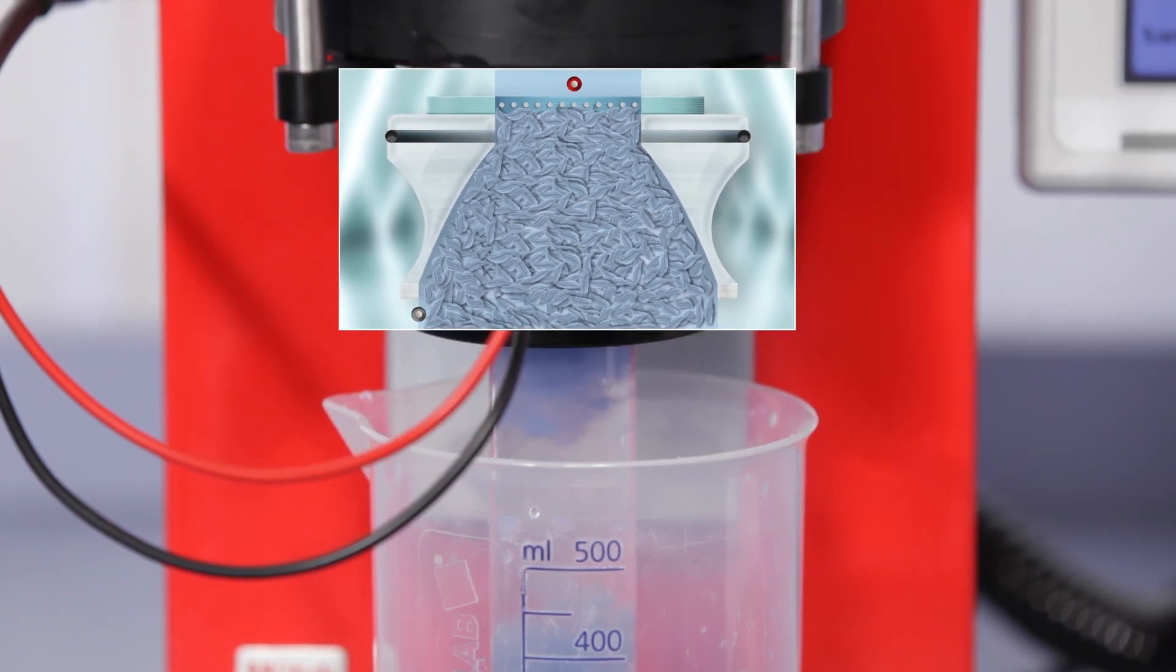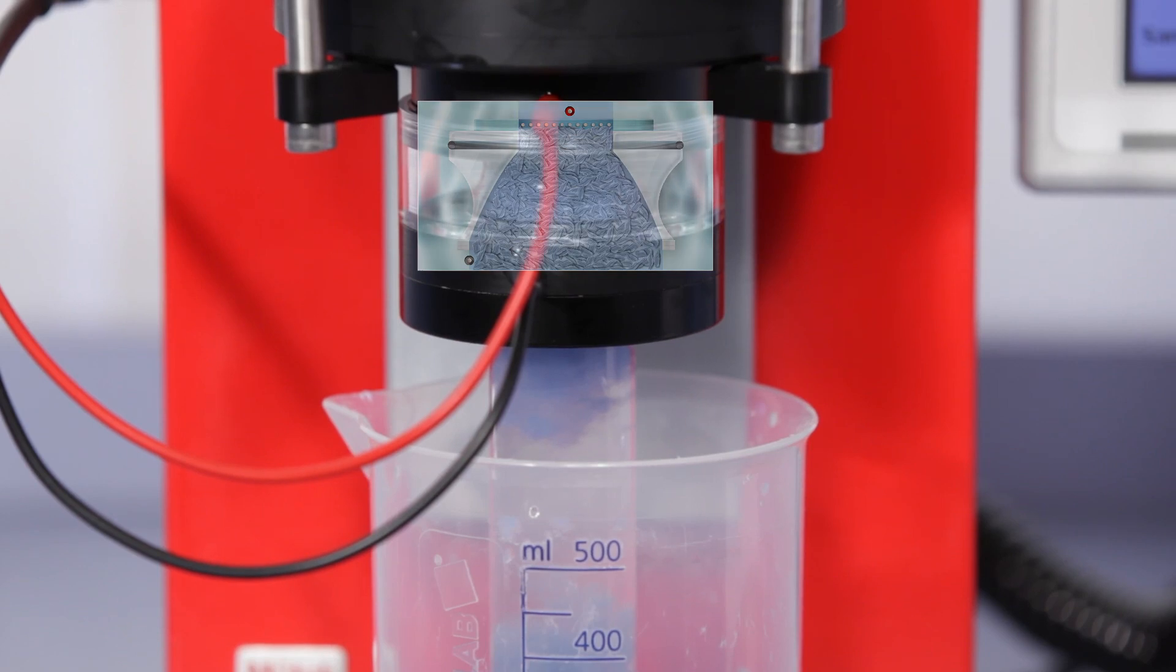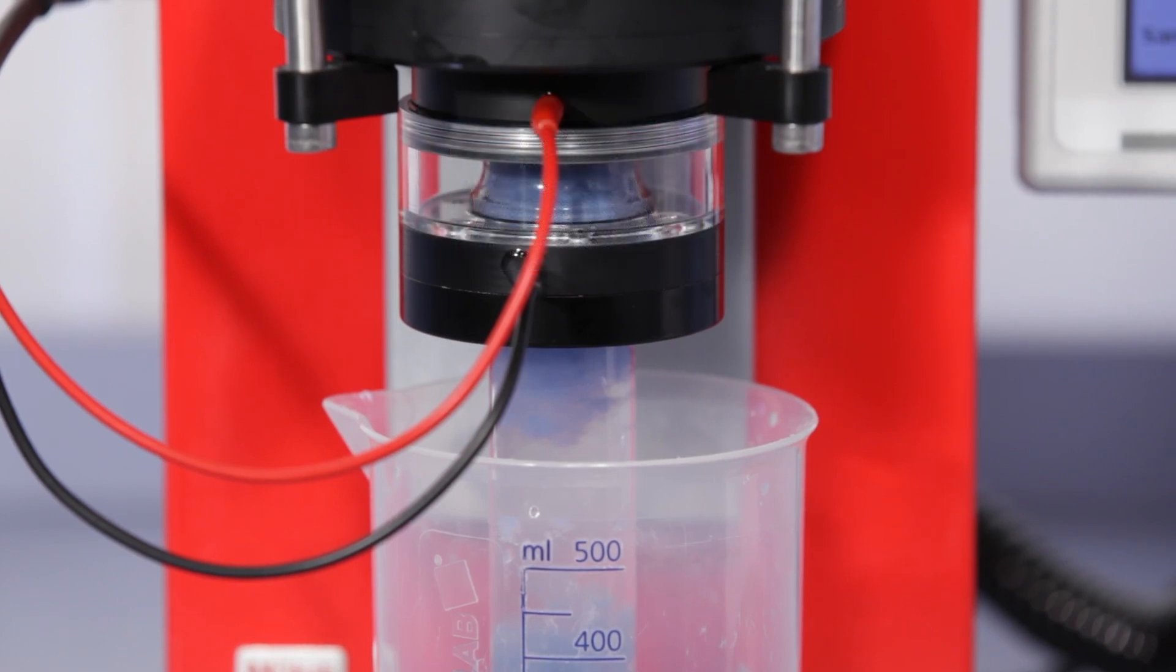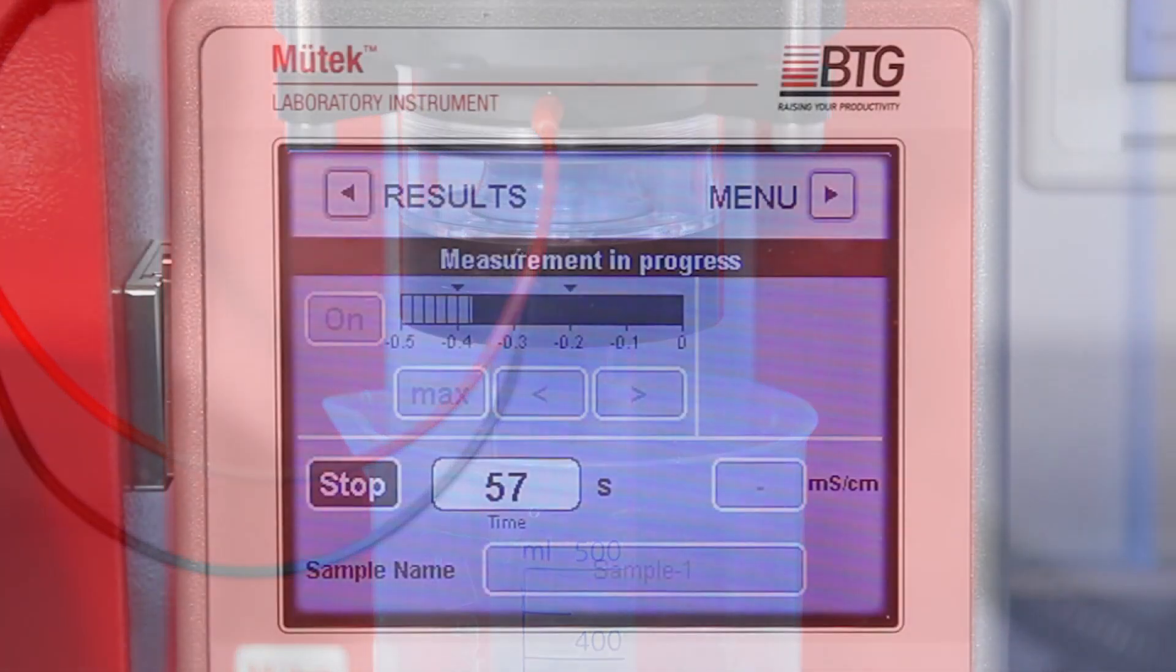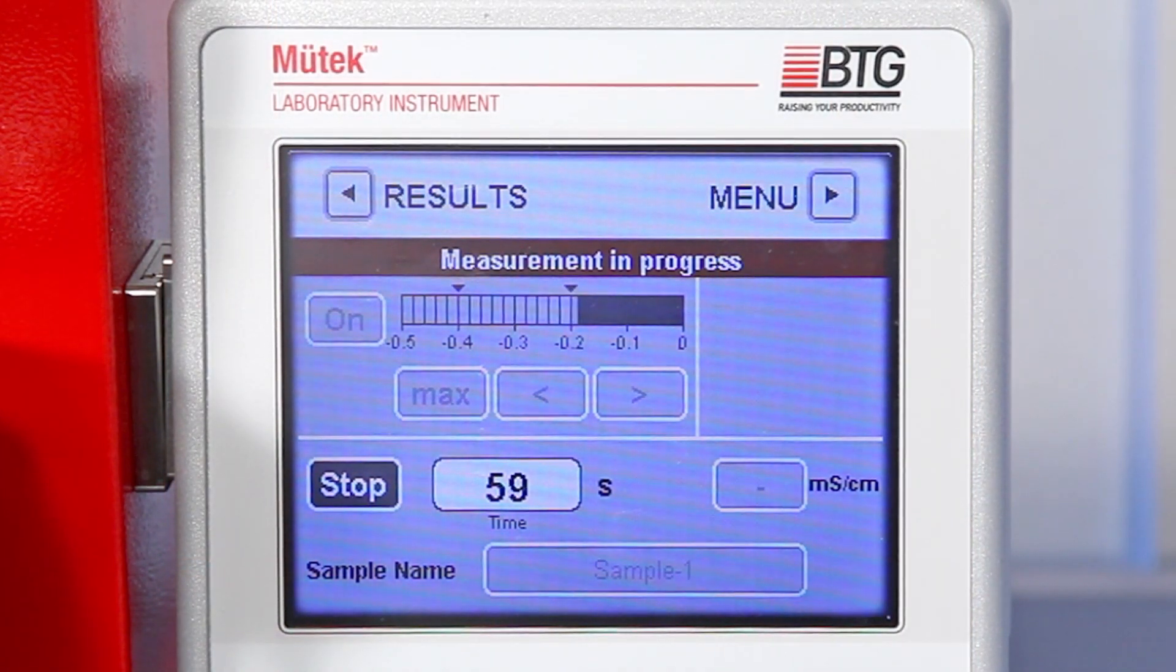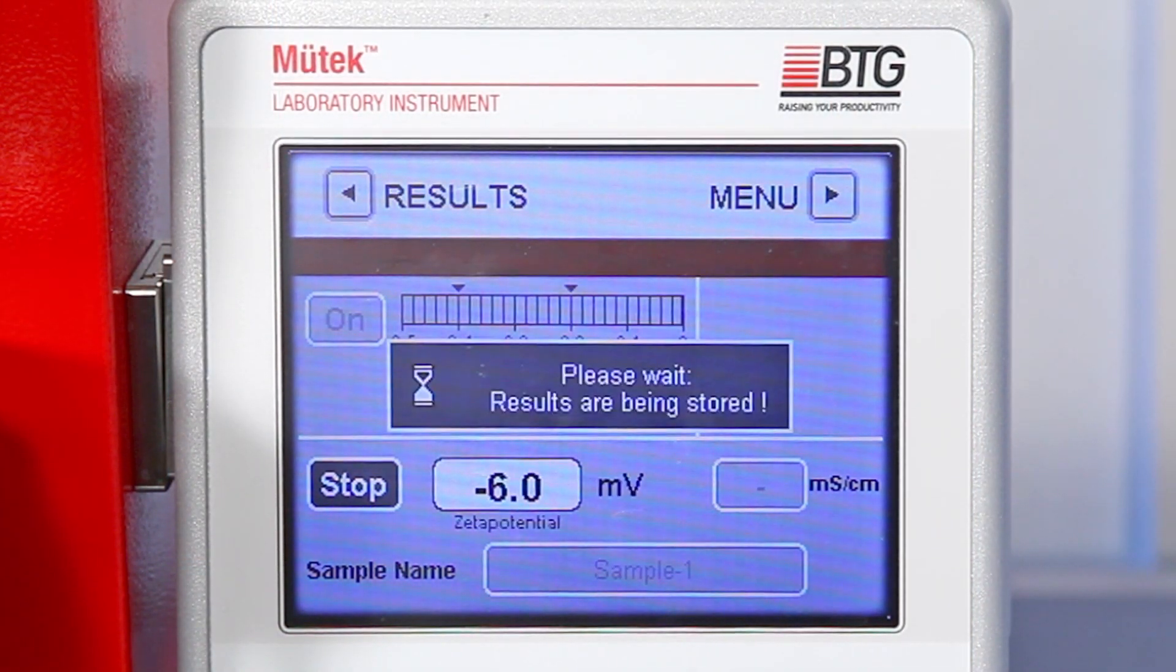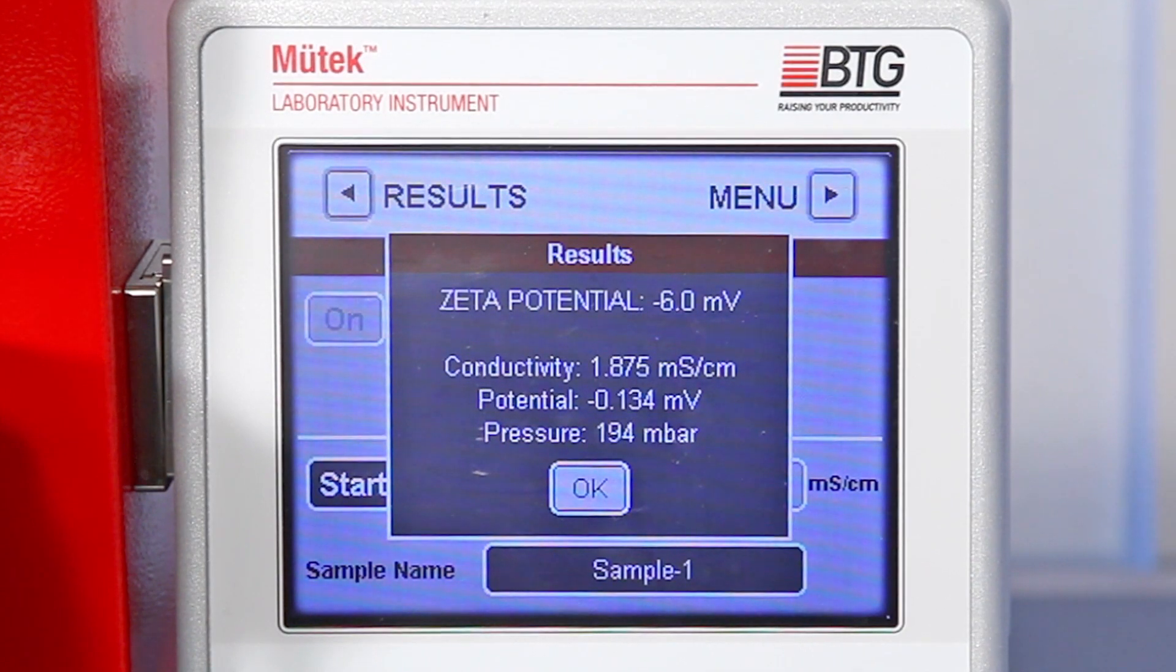Besides the streaming potential, the SZP also measures the conductivity of the sample, as well as the vacuum difference that generated the streaming potential. Out of these three values, the zeta potential is calculated.